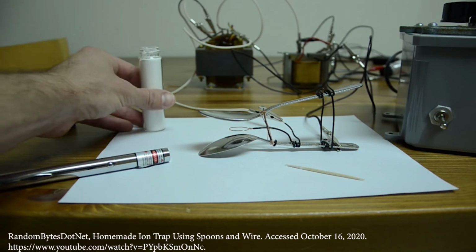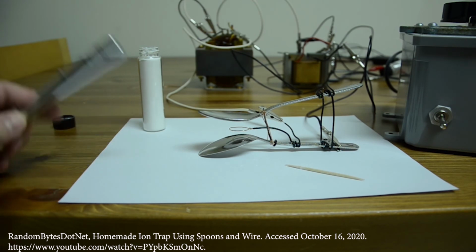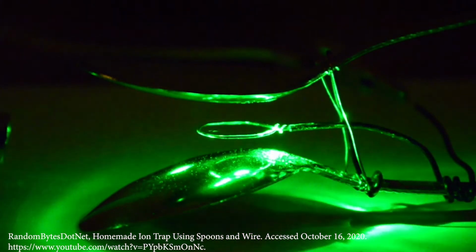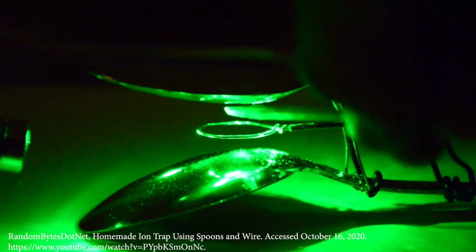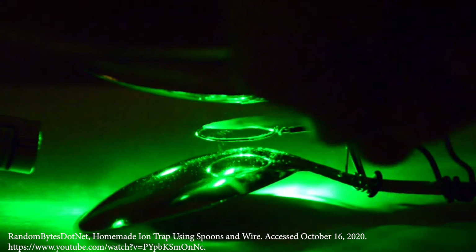He's going to take some flour instead of tiny ions. He's going to turn off the lights and use this green laser so that you can see the trapped particles. The flour is going to get charged. He's going to put a little bit of that on the toothpick and try to get some of the charged stuff in there. And look at that.